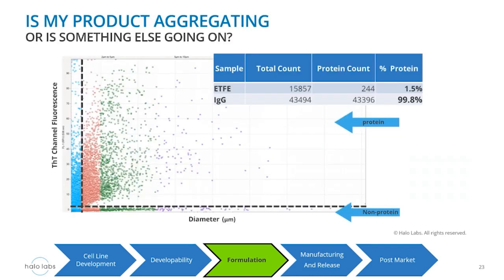Or perhaps you want to understand the behavior of your product. You want to see if your product is what's aggregating, or perhaps there is something else going on. Maybe the particles are foreign contaminants of some sort. Well, this is where the fluorescence membrane microscopy really helps us out. As I've already mentioned, ETFE and protein aggregates are very similar in their morphology. But then when we stain, this is the same sample that we just saw. It's a combination of ETFE and human IgG.